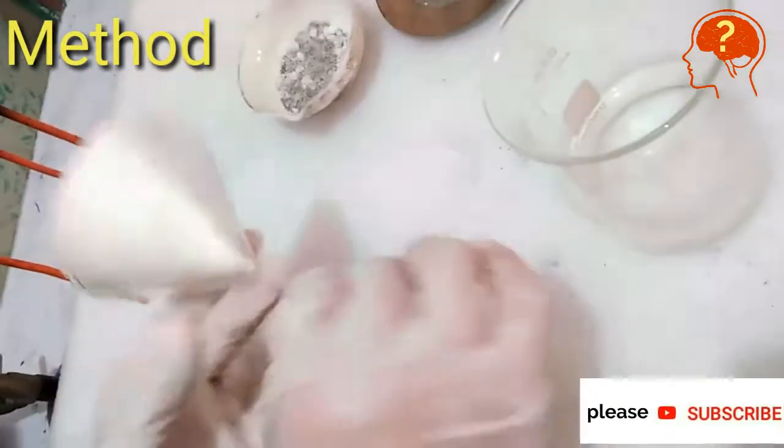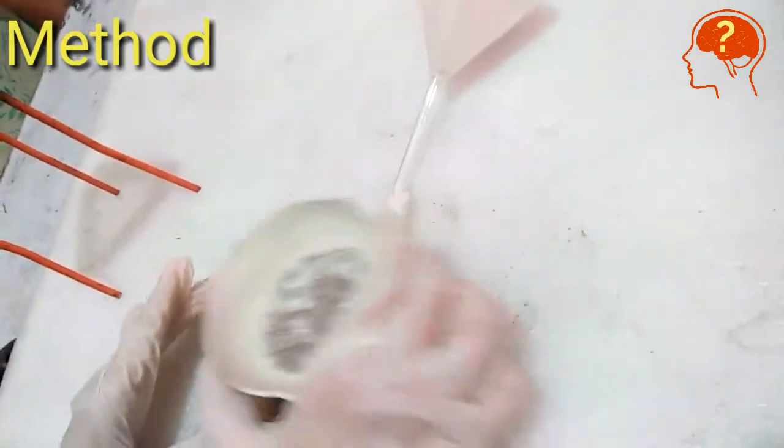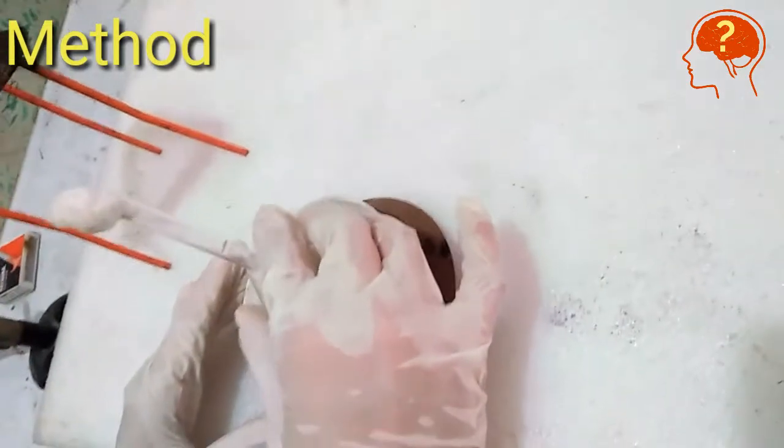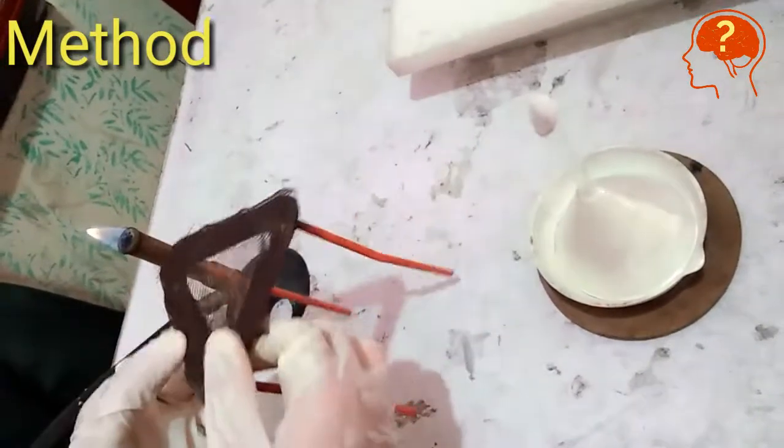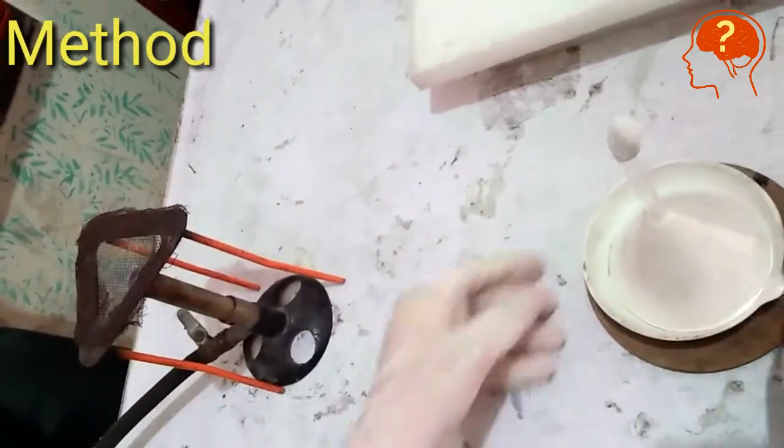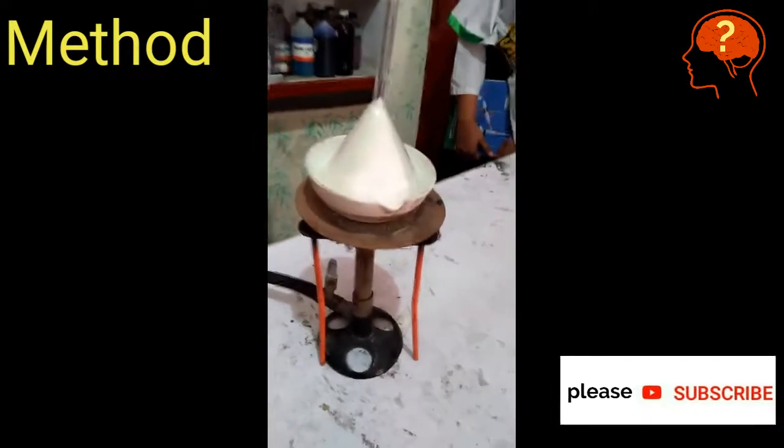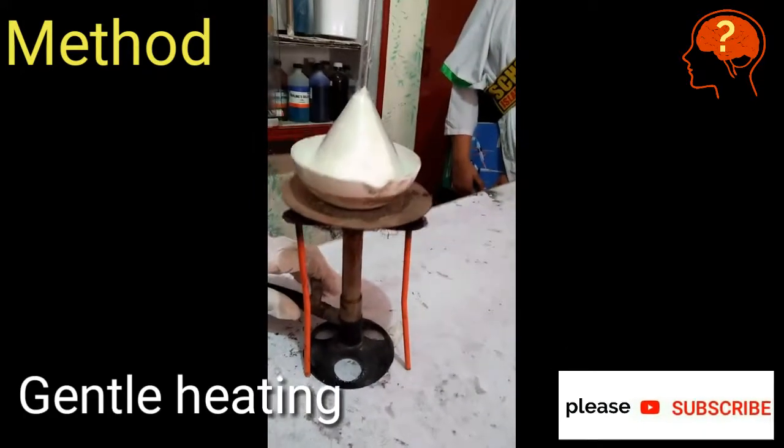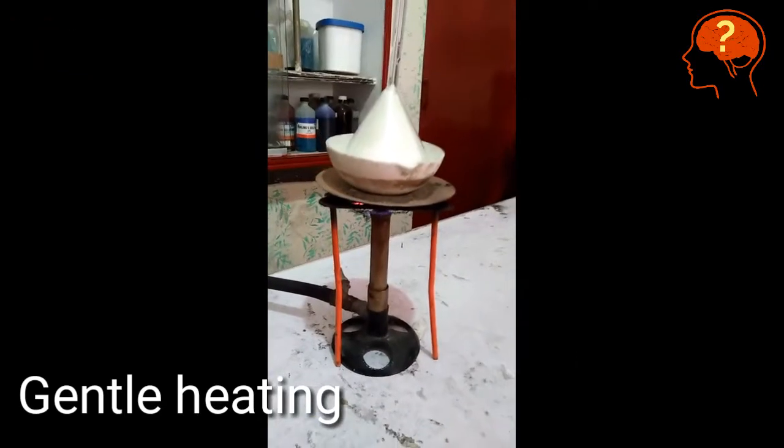It would prevent vapors from releasing out. Now put the mixture on sand bath and invert the funnel over the mixture. Light up the lamp and place tripod stand over the lamp, and also place the sand bath on the tripod stand. Allow it to heat for four to five minutes on gentle heating. Don't use high flame; it should be heated gently. After five minutes, remove the funnel and check.